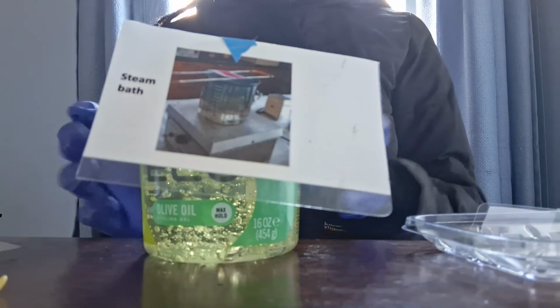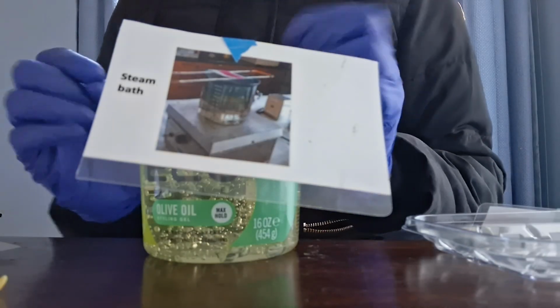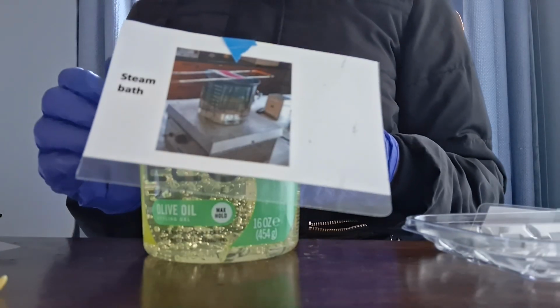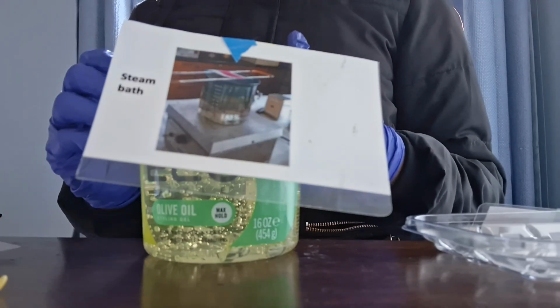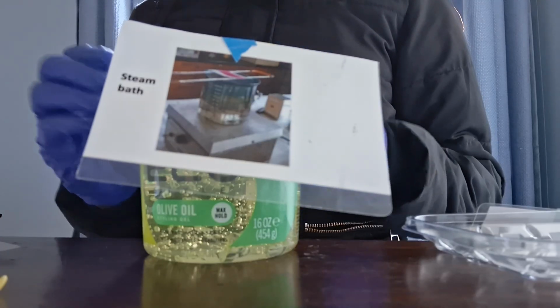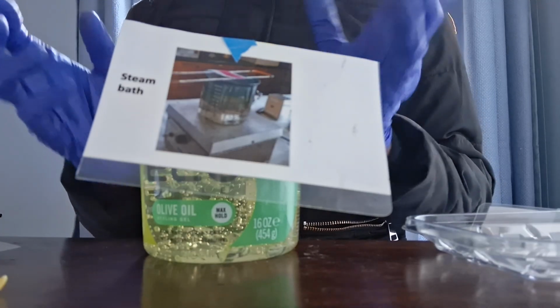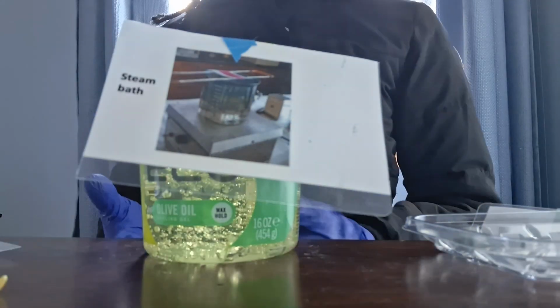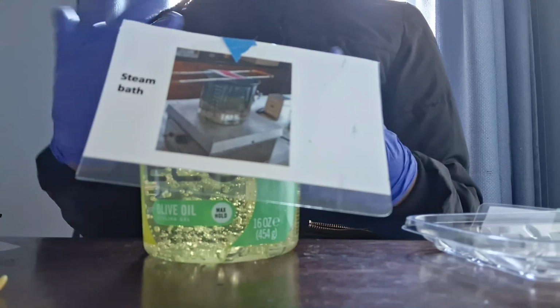The steam bath will soften and melt the waxy mycolic acid. The heat will help loosen and soften the wax to help the dye penetrate, and it will help the carbol fuchsin enter the cell.